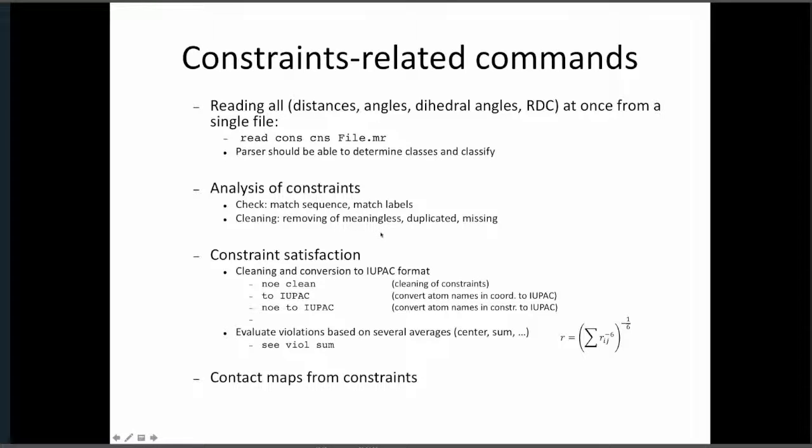Meaningless means that sometimes there are a few, or more than a few, NOEs that are not really useful, because they come determined by the geometric stuff from the residue. So the program will locate those ones and then remove them.